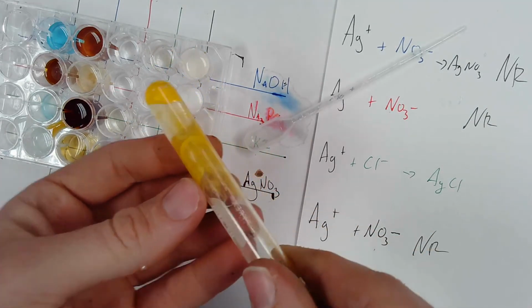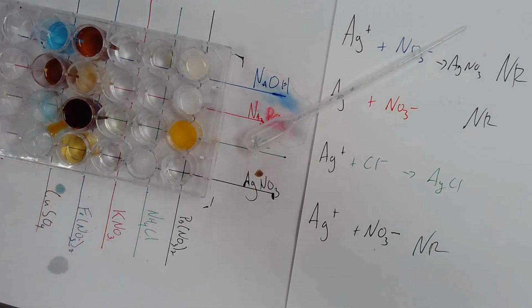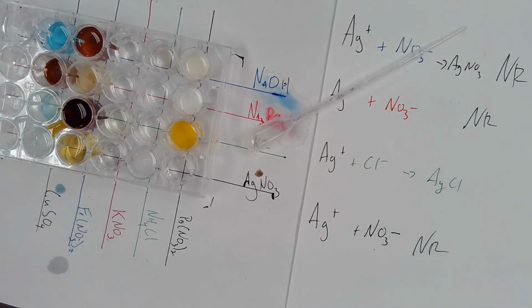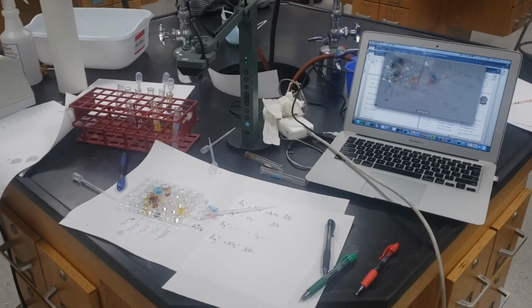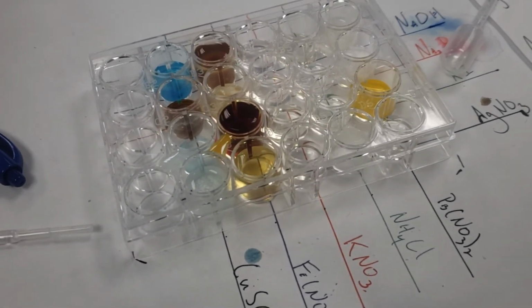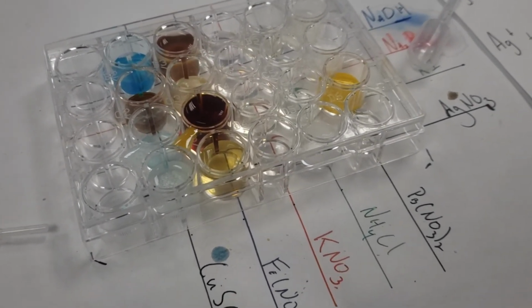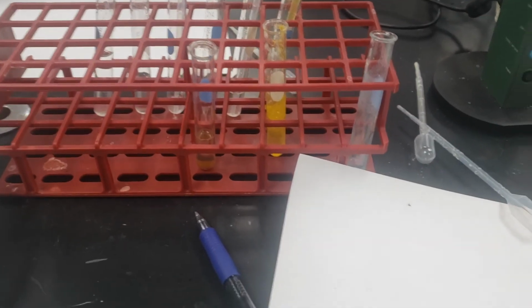Coolio. Now, I want to give an idea of what my workspace looks like at the end of carrying out 20 reactions and trying to film them. So let me switch to a different camera really fast. And that's a pretty big yikes, right? Actually doing chemistry requires a lot of setup and cleaning. And yeah, these well plates make it a lot easier, but I want you to imagine carrying that all out in like a test tube rack like that. It would be awful, right? And how do you keep track of which things you've used and which things are clean or not? That's the challenge of it.